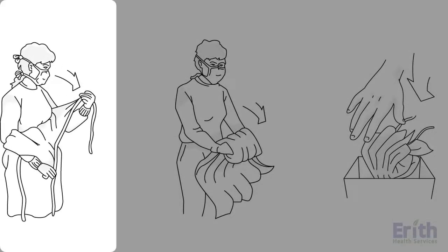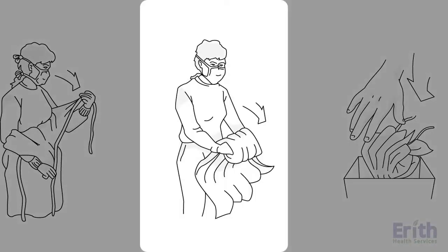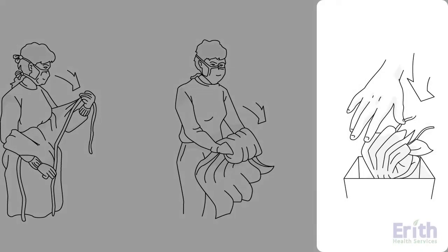How to remove. Unfasten ties. Peel the gown away from the neck and shoulder. Turn the contaminated outside toward the inside. Fold or roll into a bundle and discard.